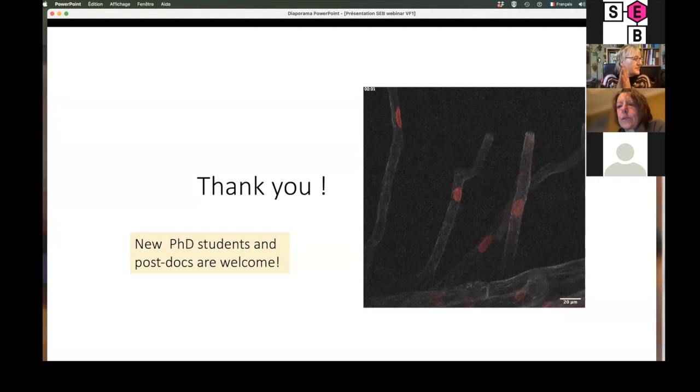So a question from Christophe: drugs to inhibit some of the putative factors of nuclear migration. Of course, we can play with actin, with cytoskeleton drugs, but also with oryzalin to alter microtubule dynamics. And can you also control some ion concentration, calcium at the root tip? Yes, we have some markers to control this calcium flux, so we can follow this by live cell imaging.